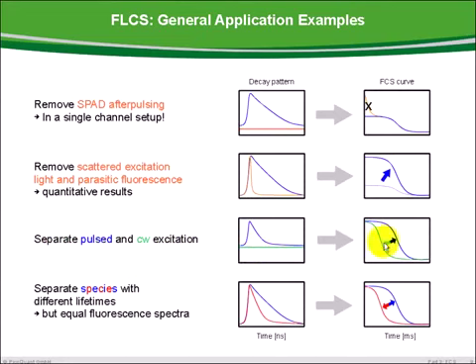Using this technique, the problem of bleed-through in two-color cross-correlation measurements can be solved. The last application is the separation of two fluorophores having similar spectral properties but different lifetime.